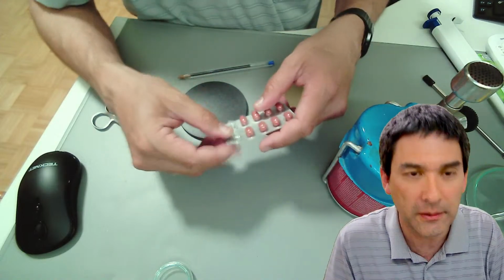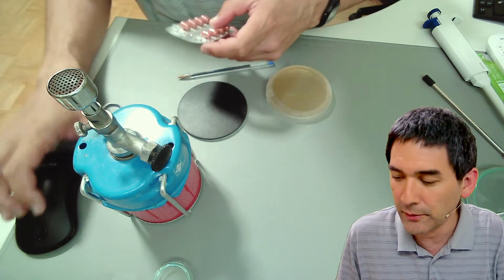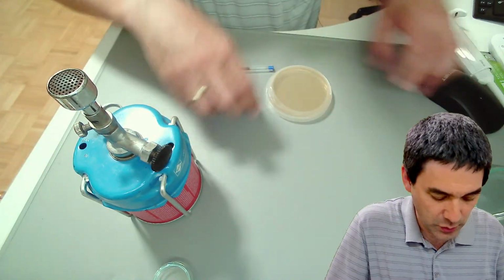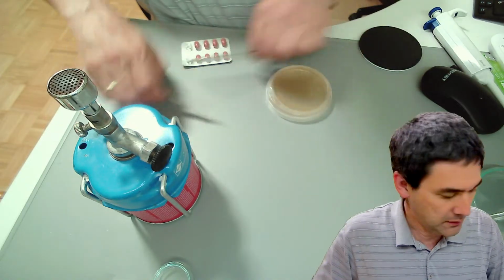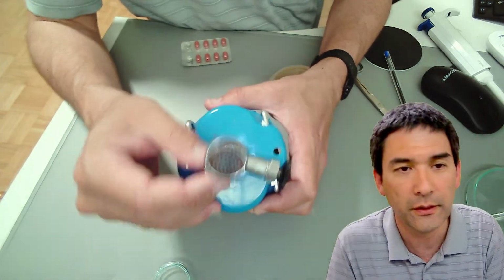So what I'll have to do now, and this is something that I've got to be careful with, is use a Bunsen burner. I have to move it away so that I don't burn myself. I put the mouse away, I put all of the things away, and I will also explain to you how you use a Bunsen burner. You've got to be careful here.